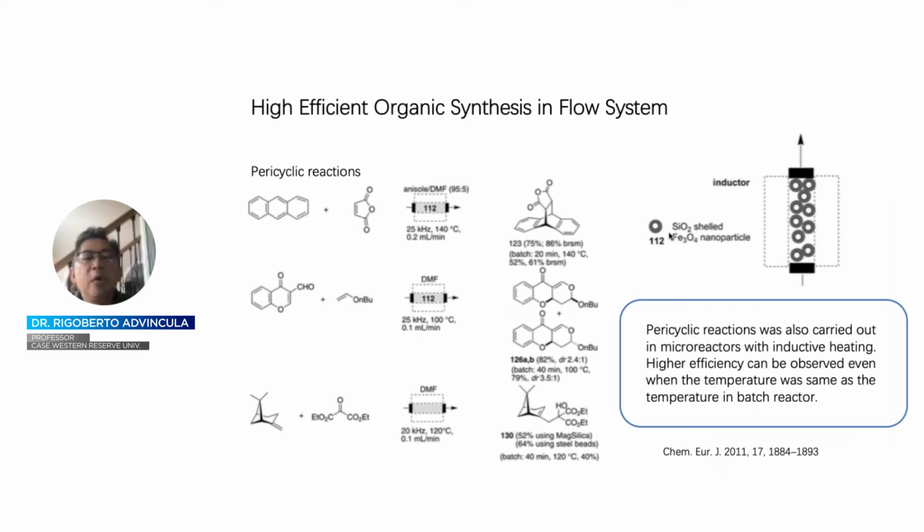Well known in pericyclic reactions is that you can apply light or heat in order to have a cycloaddition reaction as shown here. Therefore, controlling the E/Z ratio, the yield, as well as the orientation has been shown to be quite efficient with flow process parameters, including the use of microreactors as shown here.